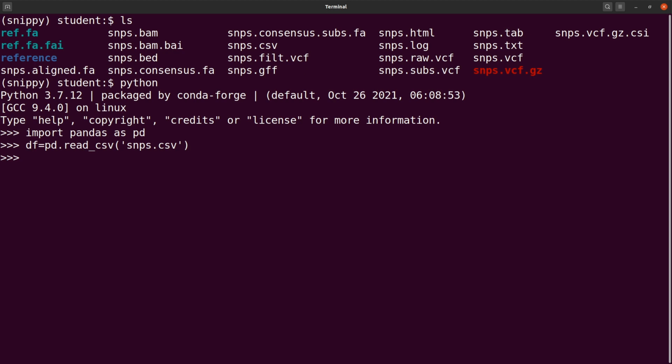So what we are going to do is to use this particular Python pandas library to answer some questions. We want to find the total number of variants. We also want to find the variant types. We also want to look at counting the various variant types. We want to count everything. And we also want to look at how we can extract information or subset information using the pandas library. So these are cool things you can do with Python.